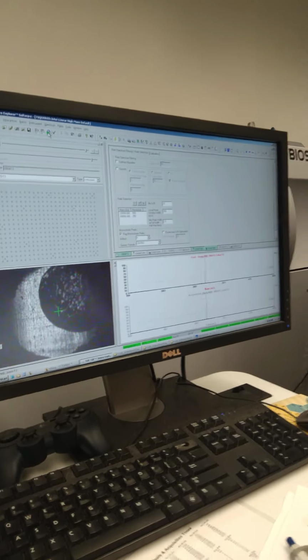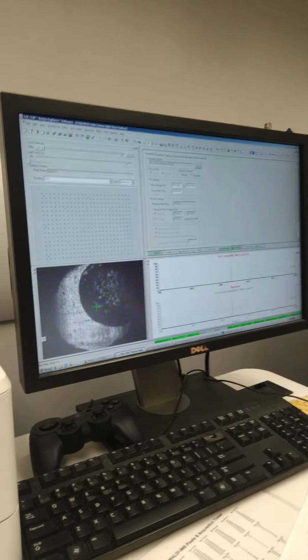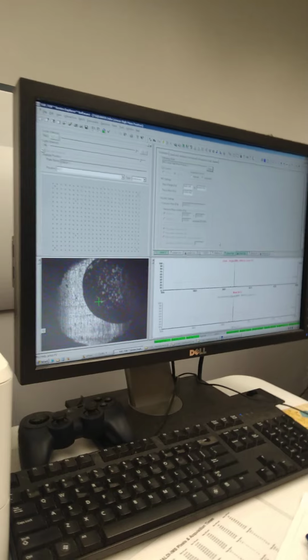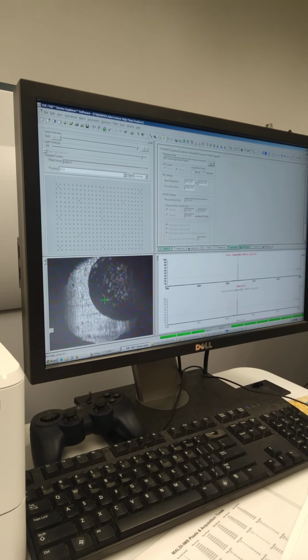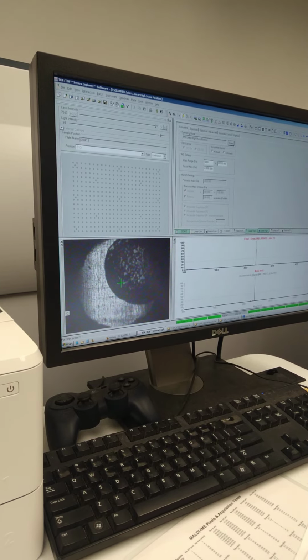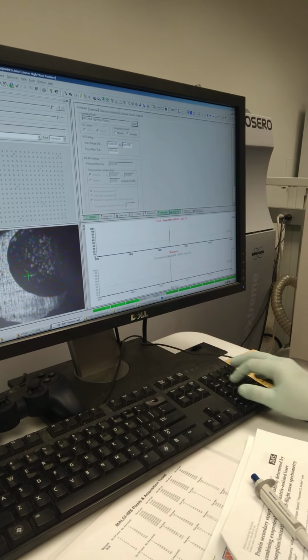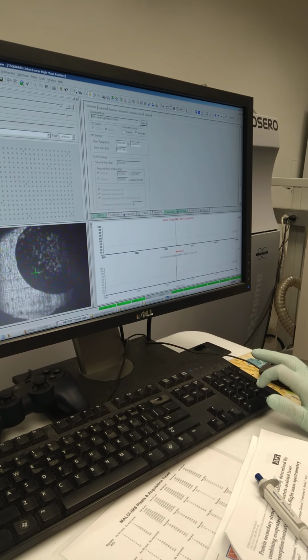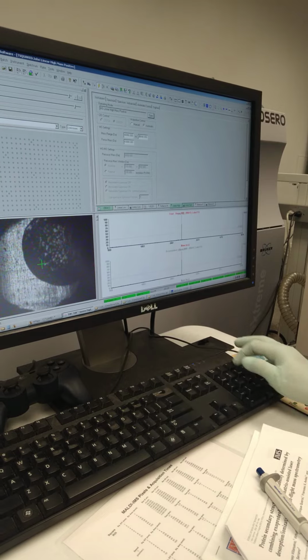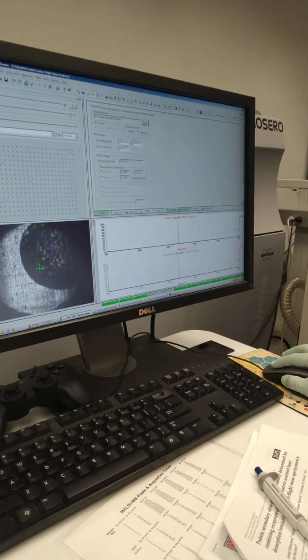All right, so now go to the linear high laser tab, and that's where you're gonna set your mass range. So let's go ahead and set your mass range. You're looking at a 60K and then you're trying to see multiplication. So maybe go 40,000, up to maybe 200,000, 250,000 maybe. There you go, that's a good number. And put your focus mass at 60,000. Let's just move that up a little bit.